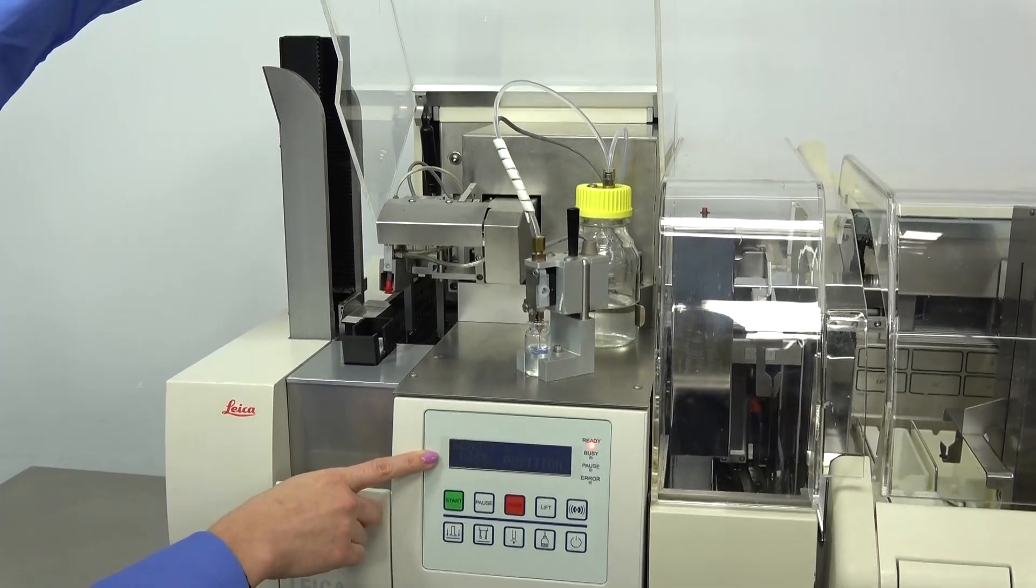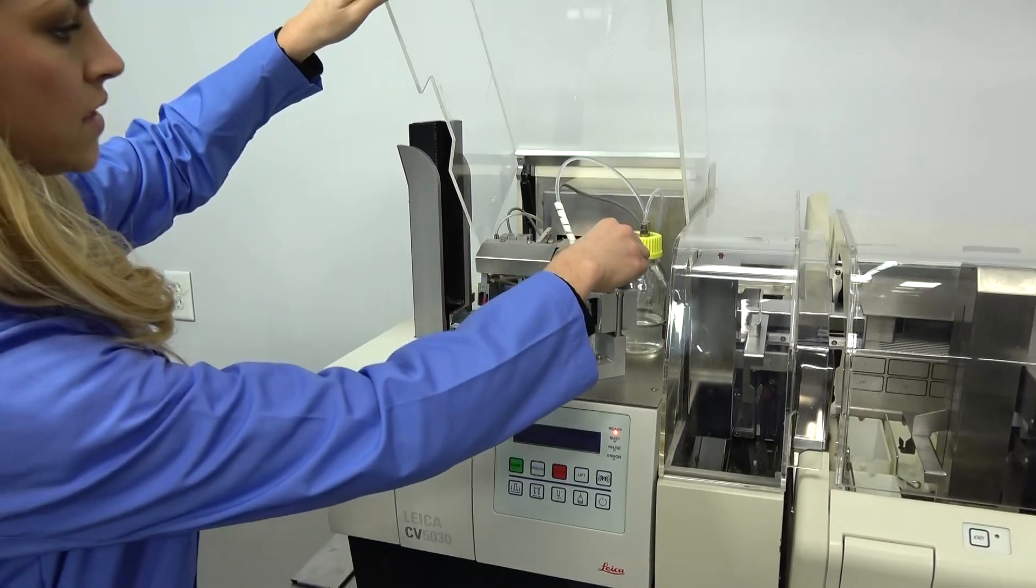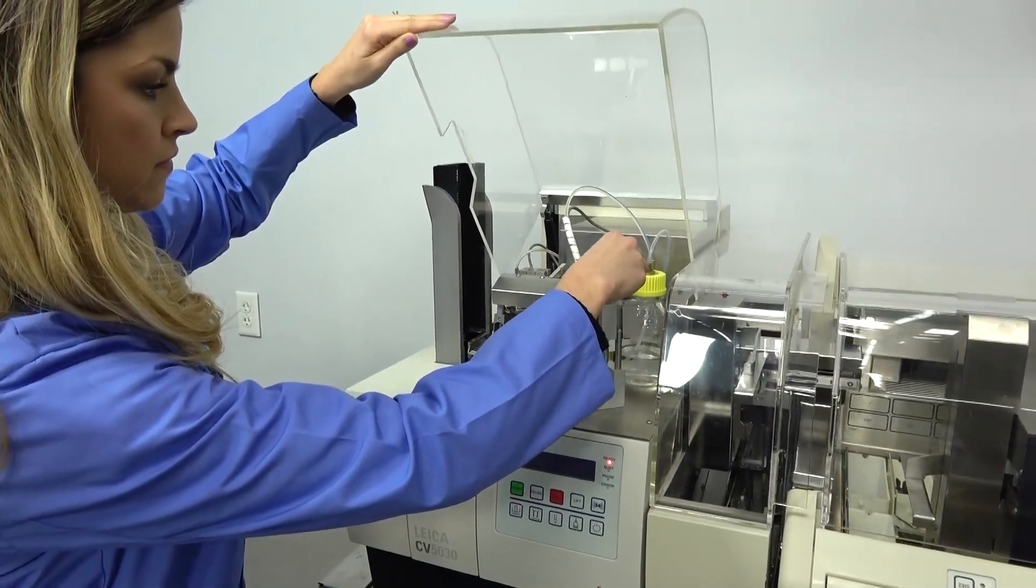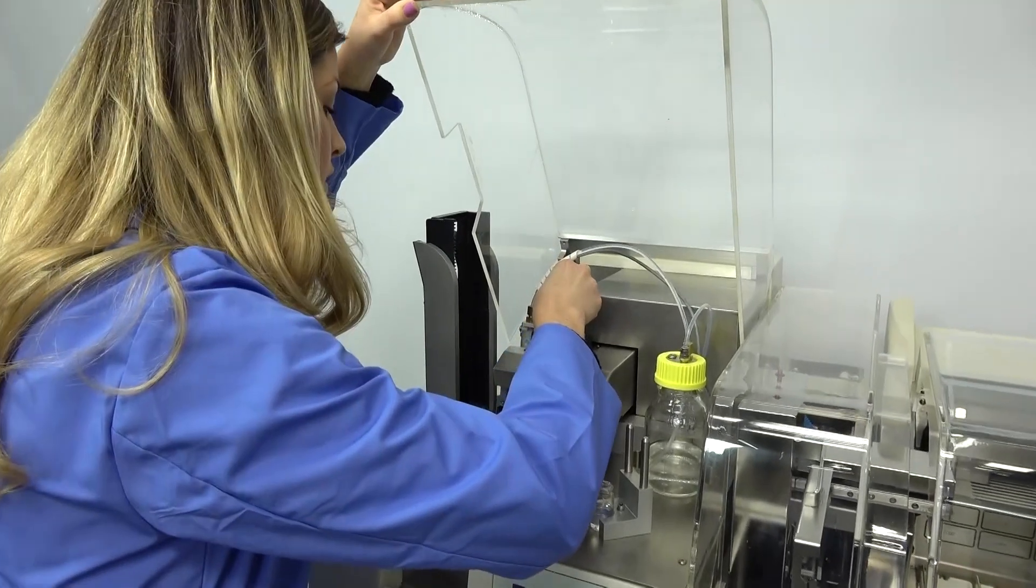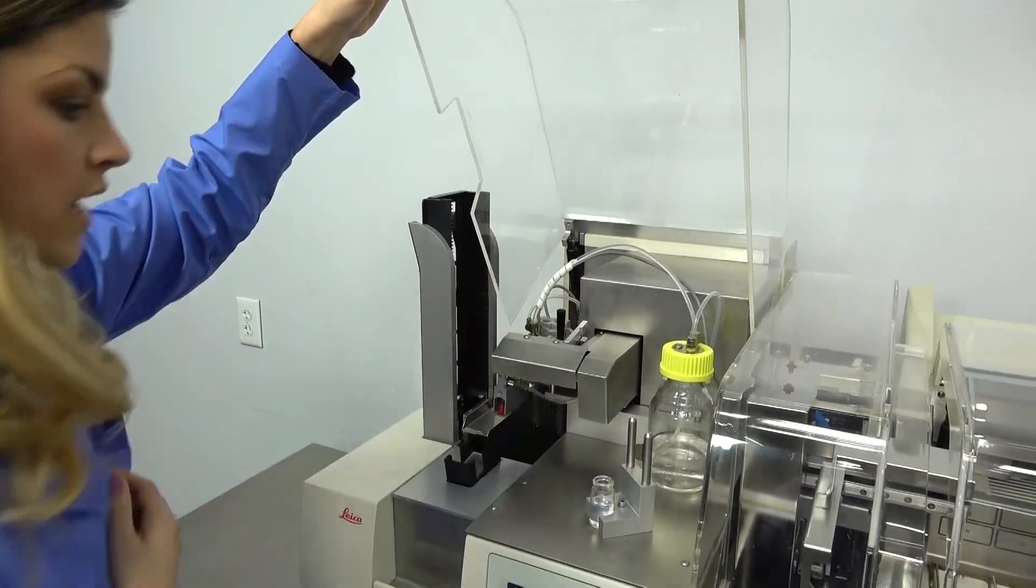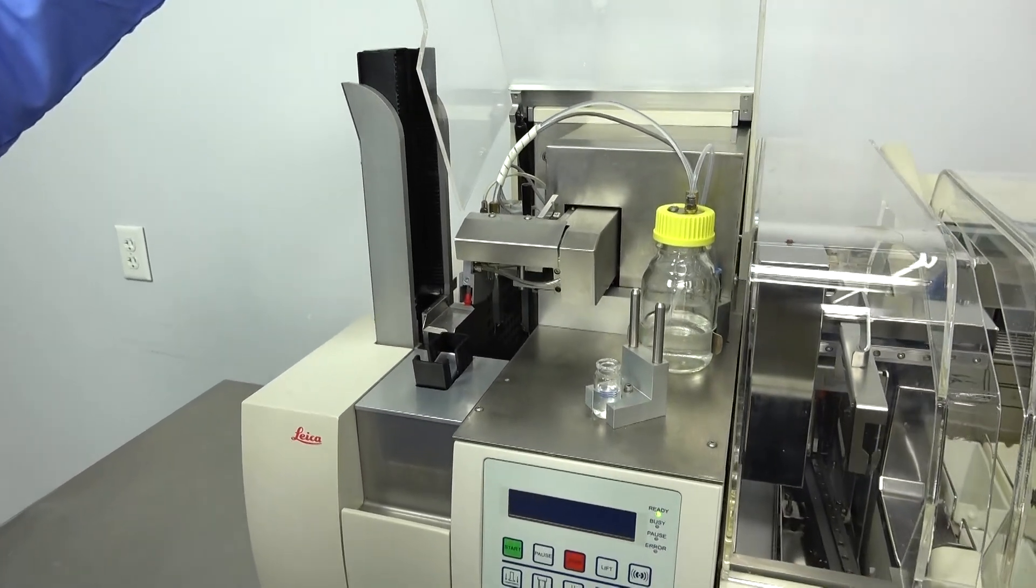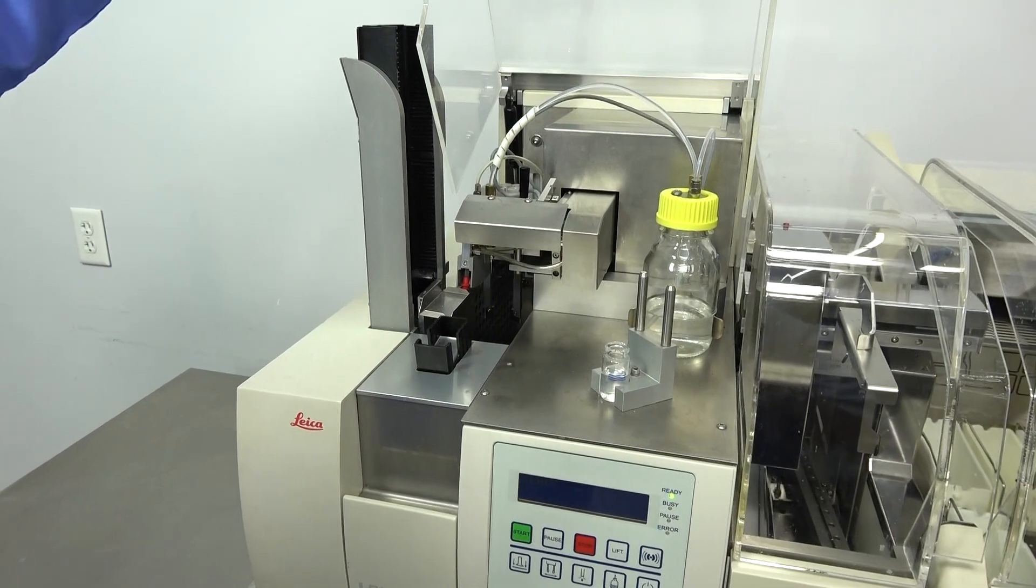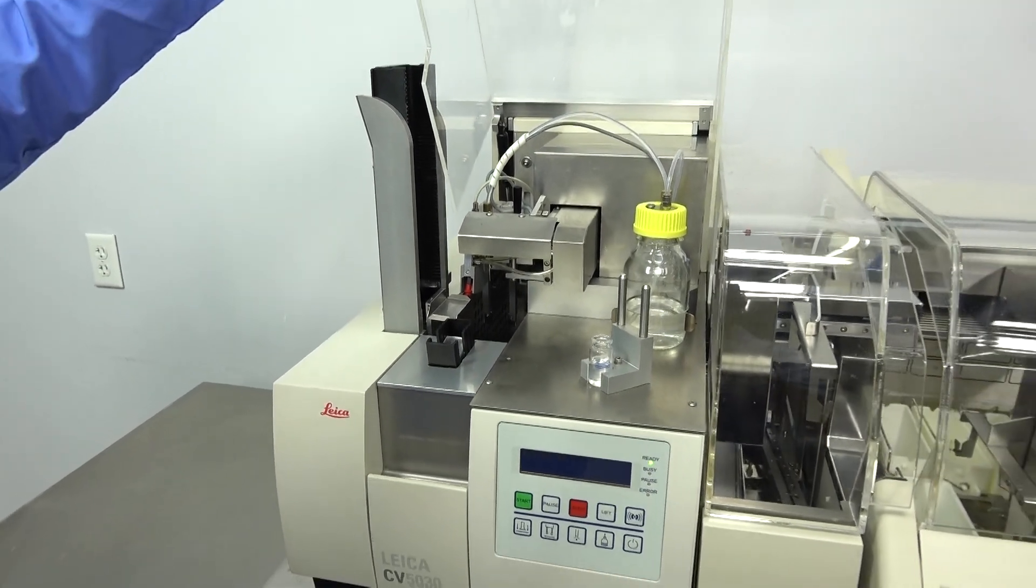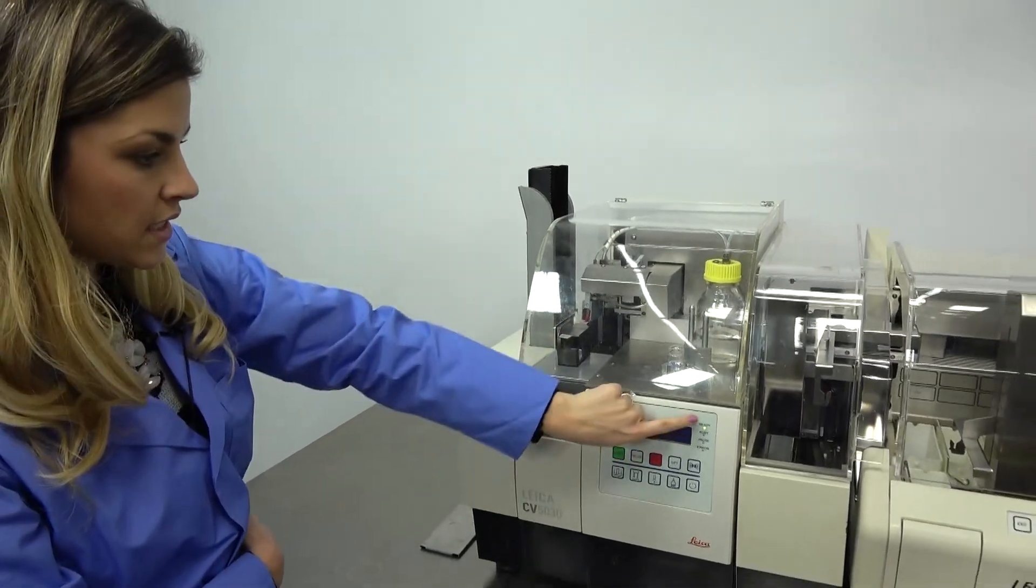Now it's telling me to return it to the dispensing position, which is located in the back. As you can see, this Cover Slipper has been very well maintained. There's not a lot of scratches on any of the hoods and there's no staining within. As we close this lid, now it's telling me that it's ready.